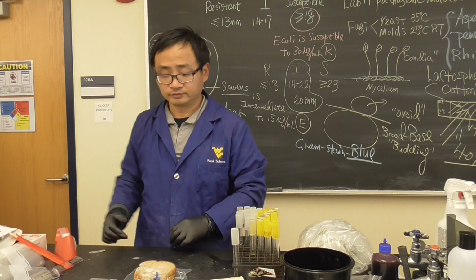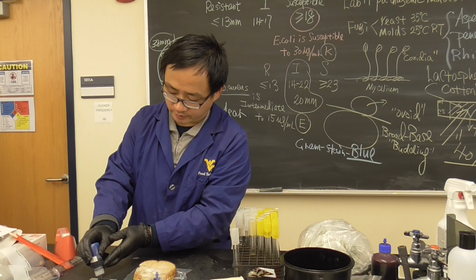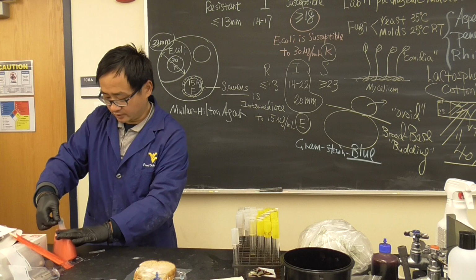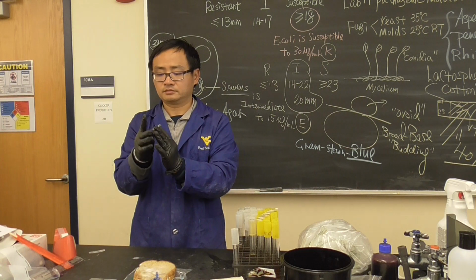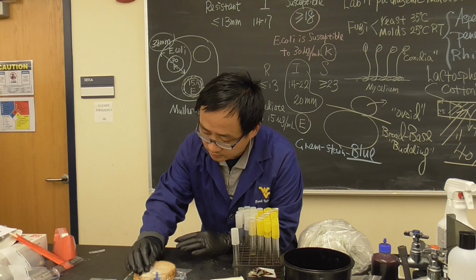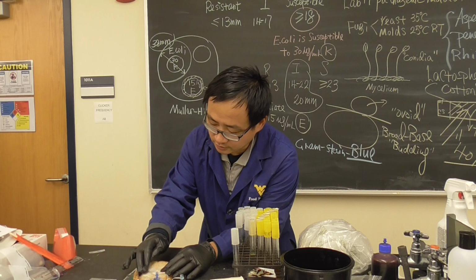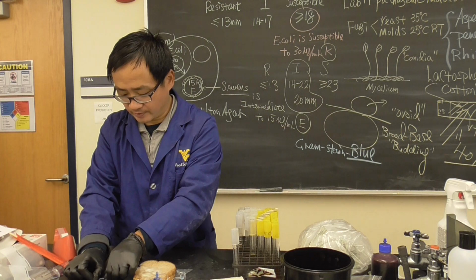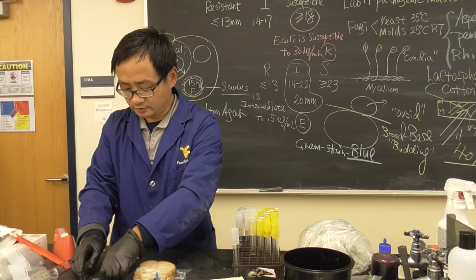How do we do it? Lactophenol cotton blue, we put 1 drop right in the middle, a big drop. It doesn't need to be huge. Then what do we do? You can come here to do it by yourself. Tape. Okay, now what do we do? Try your best to do it like this. Then touch a little bit. It should be enough. Then we slightly touch a little bit too. We'll see what it is. Okay, that's enough. Then we cover it. Be careful, this is a little bit tricky. That's all.